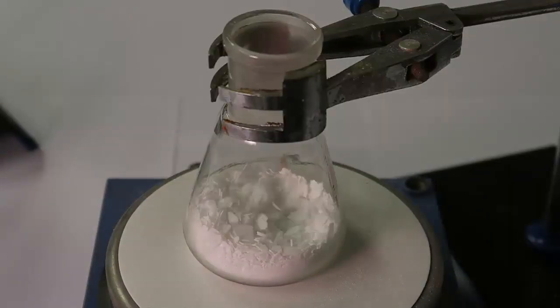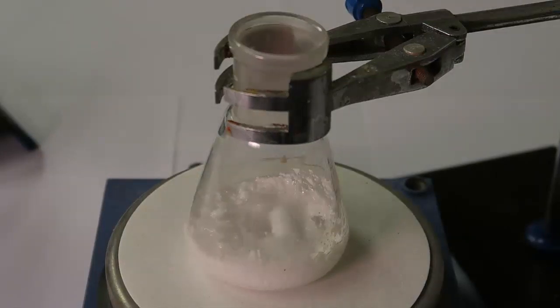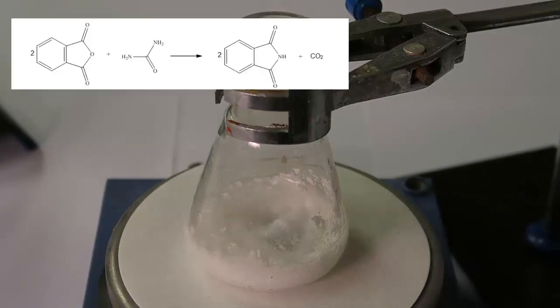The mixture is then heated to 135°C to liquefy it. Once the chemicals are molten together, that's when the reaction starts. The overall reaction is shown above. Basically, one of the amine groups of the urea attacks one of the carbonyls producing an intermediate, which then splits into ammonia and CO2 gas. The ammonia is then able to react with another molecule of phthalic anhydride.